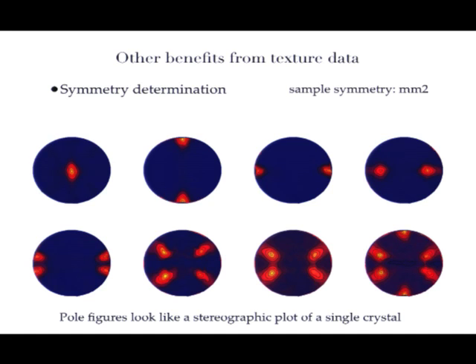But in order to do an analysis like the old crystallographer did, you need an old crystallographer to transfer these observations, these positions of the faces, onto a stereographic projection. So we can do indexing like the old crystallographer did, but you need an old crystallographer to do that. The maxima in the pole figures give us the direction of the lattice planes, as we have from optical analysis of a crystal.